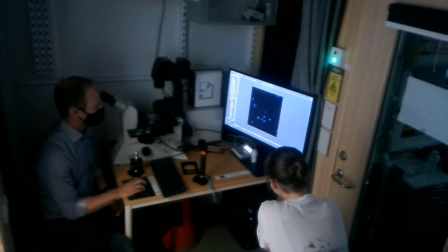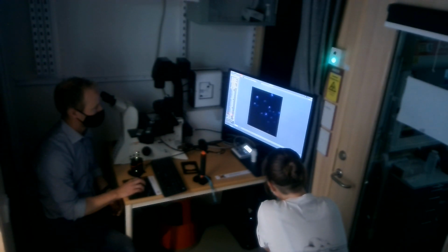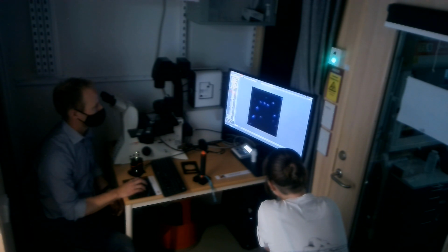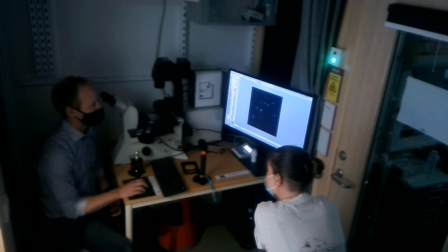So now we have A1 and we have the 9 different ones here. So I think perhaps no one was in that one. Here it seems like they might be slightly less, and here we are also quite bright. You can see that. Okay, you're still within range. They are not overexposed in this one. But it seems like the first one is brighter than the others. I don't know if that's what you expected, because here they are overexposed actually. So I would probably go in there and set it up.